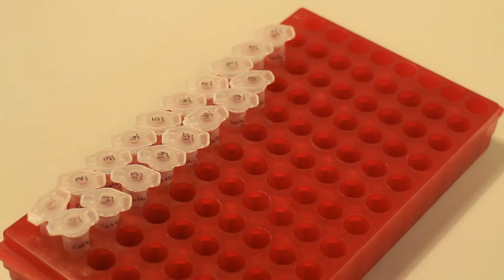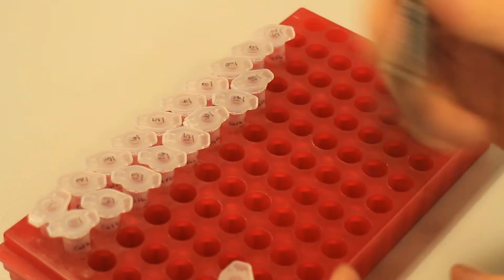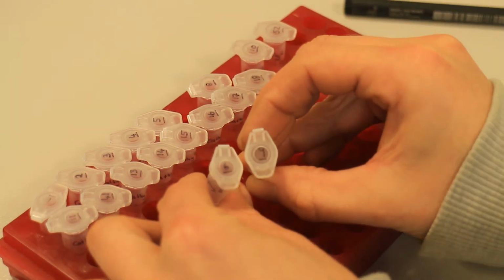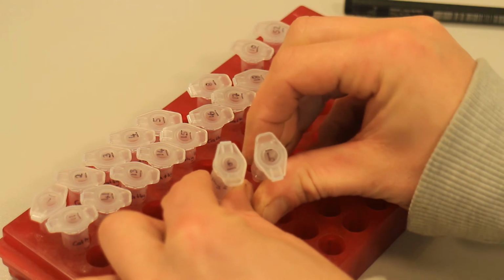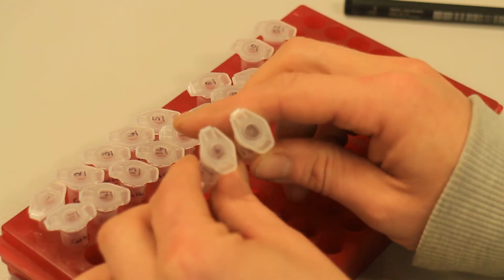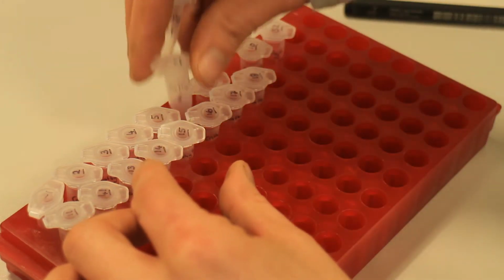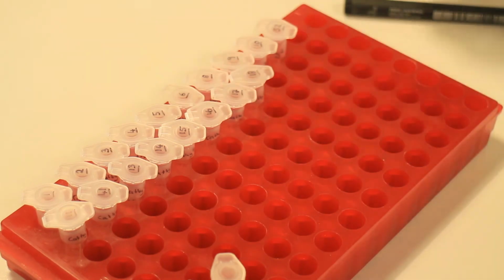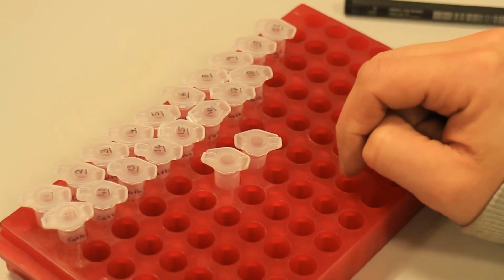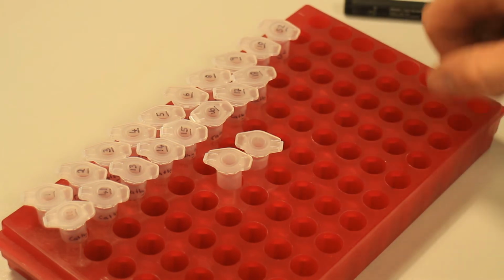When labeling your vials, it's incredibly important that you put this little line under the number, because it's not only important for number 6 and number 9, where it's relatively obvious that if I turn it around I might not be able to determine if it's a 6 or a 9. So if I put that line on the bottom, I would always be able to know where the bottom of the vial is. Because if you put them in here and then label them one after the other, it happens so quickly that you just have one vial that's turned the other way around, and you might not notice as you label them. So always put the line underneath it so you know.